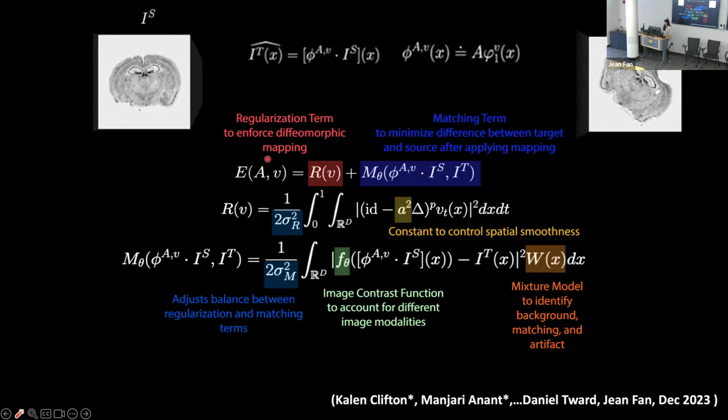However, that is also subject to this mixture model component where we try to fit what is on the image versus the background. So I can imagine if your alignment is actually quite good, but one tissue has a bit of a tear, then the matching component is slightly not comparable, and that will lead to a slightly different final error quantification.